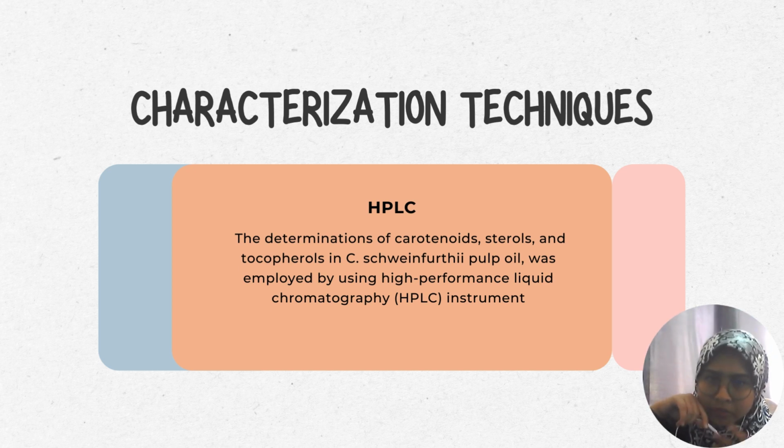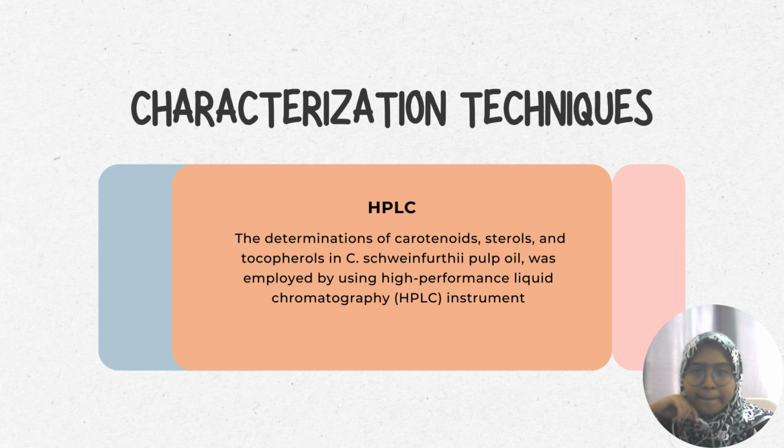The determination of carotenoid, sterol, and tocopherol in Canarium schweinfurthii pulp oil was done using the HPLC instrument.